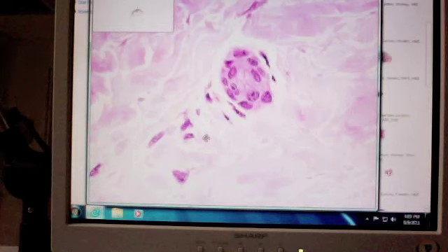All right. If I said this epithelium represents what portion of a gland? Parenchyma. Okay. Because the parenchyma of a gland is going to be the duct and the secretory portion. All right. No, I would not give you a question like that in the exam. But this, in terms of just making sure that you guys understand that here, obviously, when we do the ducts, we'll revisit that. Okay.